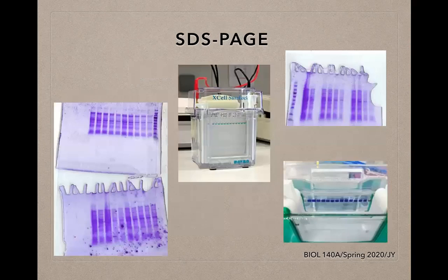In the next image, you'll see the electrophoresis box in the middle. As I mentioned, you can have 2 cassettes in a given structure, and 2 of those structures will fit into the electrophoresis box. Followed by that, you will attach the lid, and then you will connect the electrodes to the power source. One thing about SDS-PAGE is that it only takes sometimes 15 minutes to run the gel, whereas agarose gel electrophoresis can take about an hour to separate bands of DNA. Whereas for SDS-PAGE, you can ideally just utilize it for 15 minutes in order to separate bands of protein.